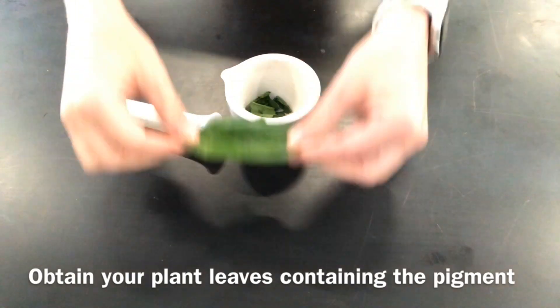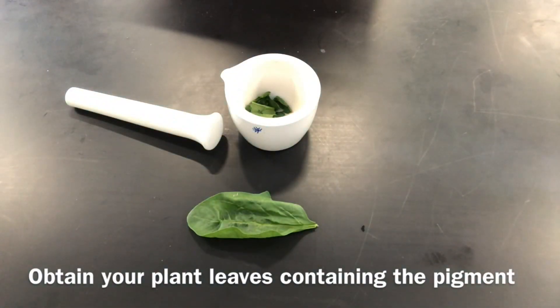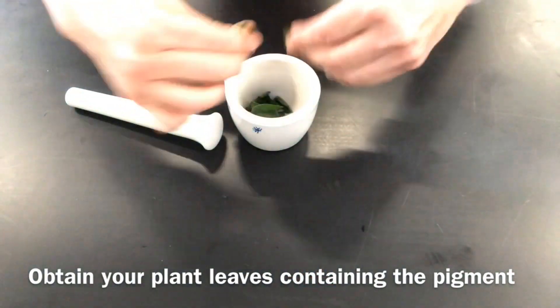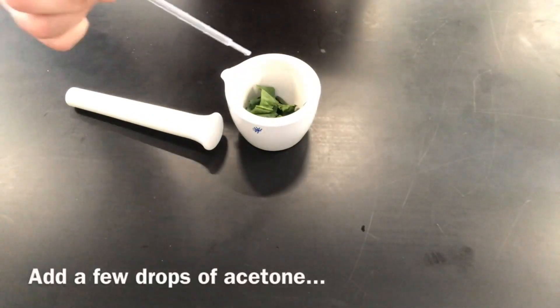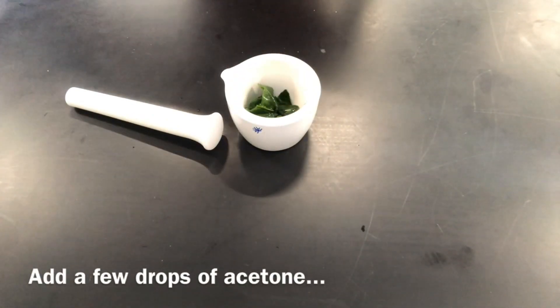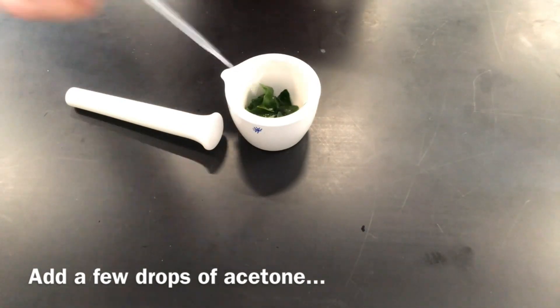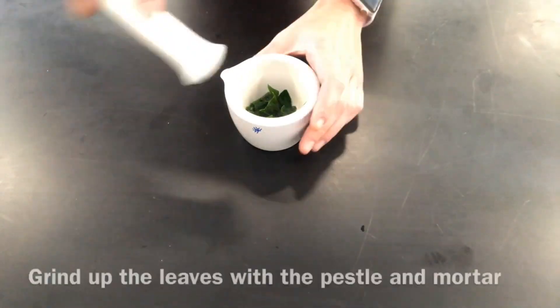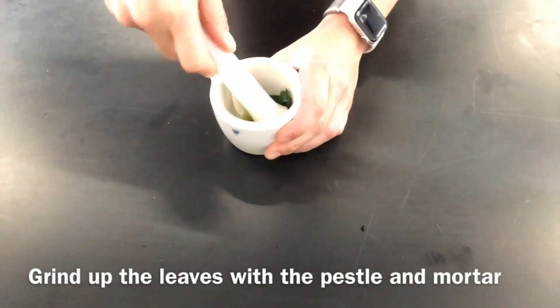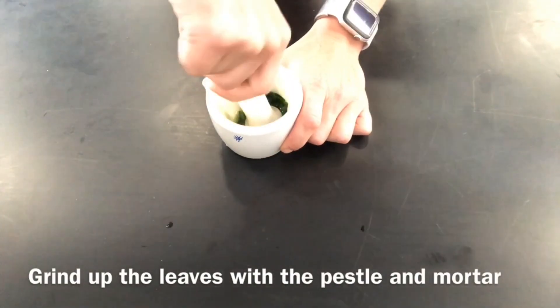In this example I'm going to use spinach leaves. The first step is to obtain your plant that contains the pigments you wish to separate. Break up one of the leaves into little pieces and place it in a mortar. Add a few drops of acetone and a little bit of sand, as this helps with grinding up the leaves. Use the pestle and mortar to grind up the leaves and to release the pigments.